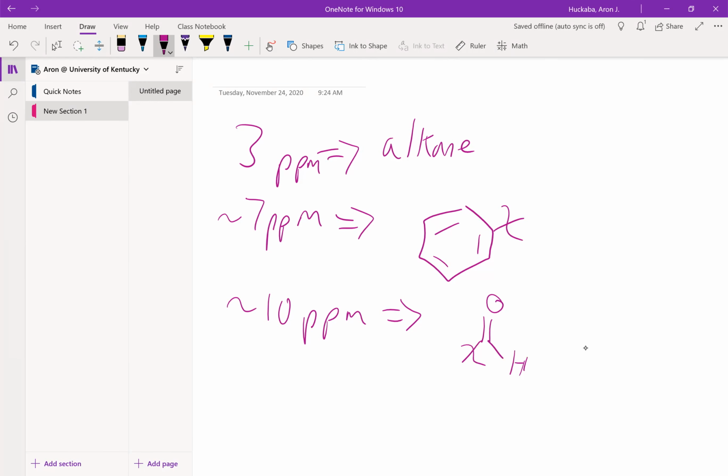And I'm using these squiggly lines to show that they have some connections here, and that's our fragment. So going back to this alkane one, remember that there were two triplets right next to each other, which tells us that likely these are two CH2 groups bonded next to each other. And it's likely that there are two different groups bound to each carbon, both with different polarities. That would give us the overall 4 integration that we observed.